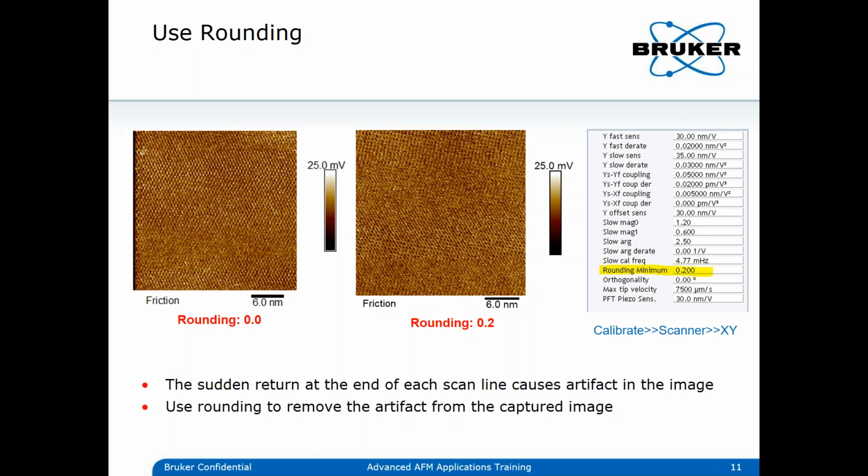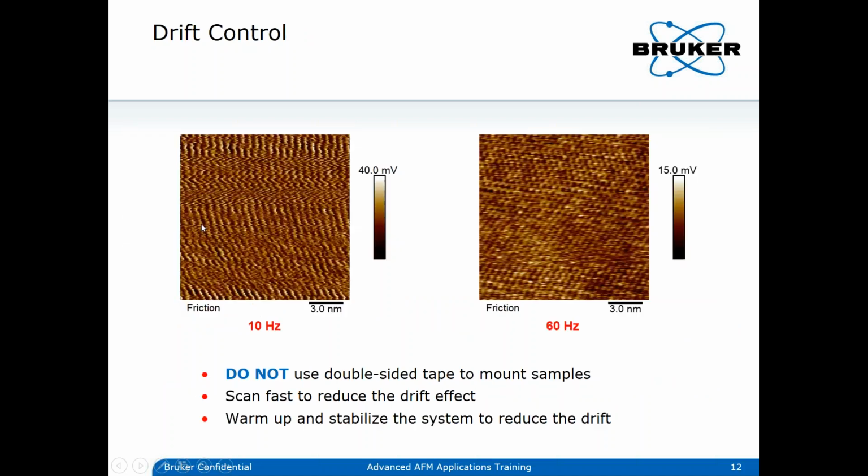The scan is larger, so it returns then within this 20%, and so you don't see the rounding effect any longer on your image, or you still keep the same scan size. So it is, again, therefore removing this artifact from the image. You can see it again.